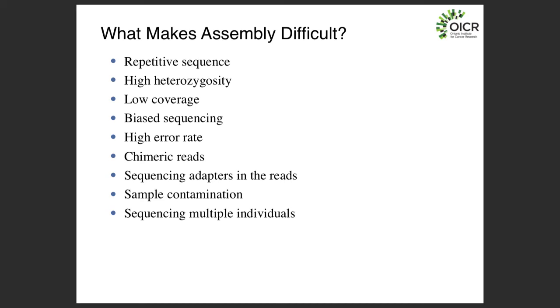So they make it look like repeats, but they're just artificially induced repeats by a flaw in the library preparation step. They typically occur at a very low rate, so you don't have to worry about them too much, but the assemblers will typically have special code to look for structures that are only supported by one or two reads and then try to get rid of them.